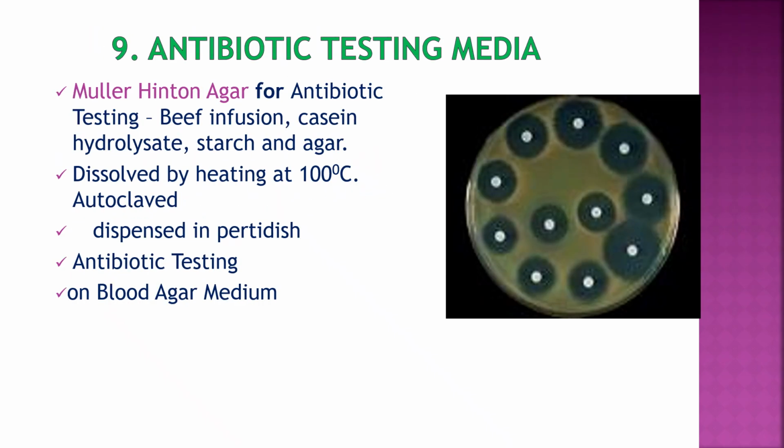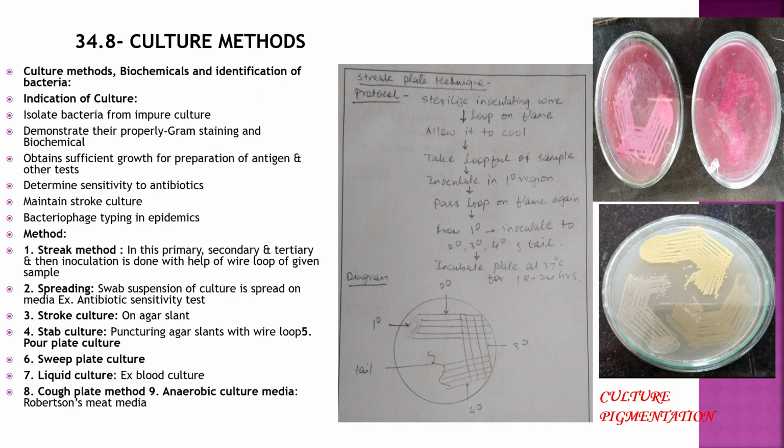Antibiotic sensitivity testing is done on Mueller-Hinton agar, and that is usually done by the Kirby-Bauer disc diffusion method.